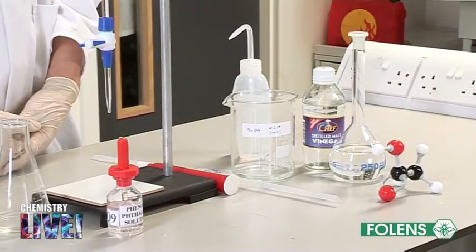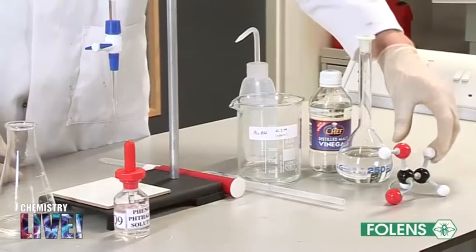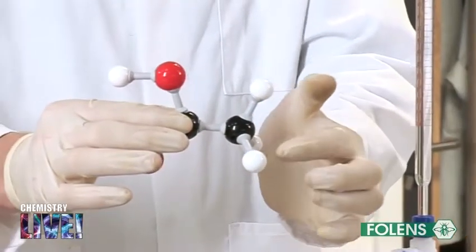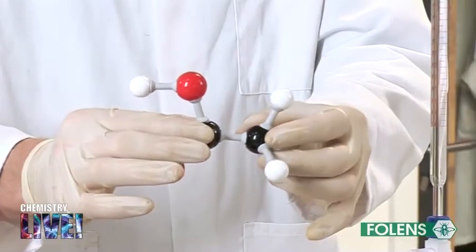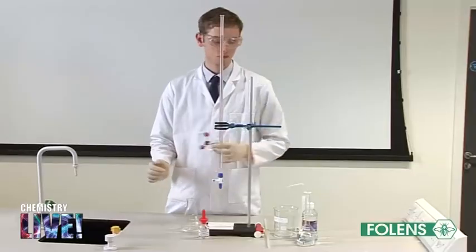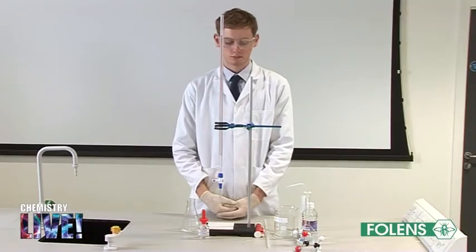Experiment to determine the percentage of ethanoic acid (acetic acid) in vinegar. Vinegar is a weak solution of an acid called ethanoic acid, whose formula is CH₃COOH, the old name of which was acetic acid.